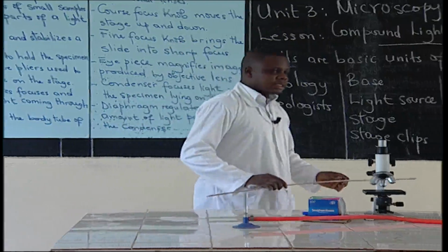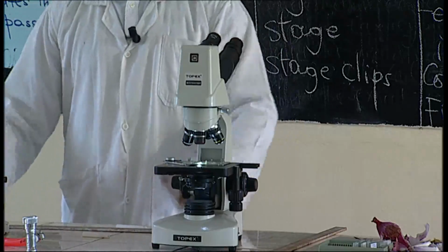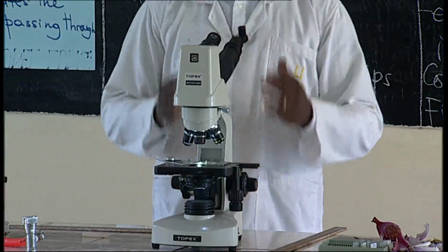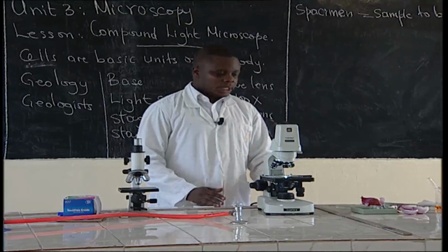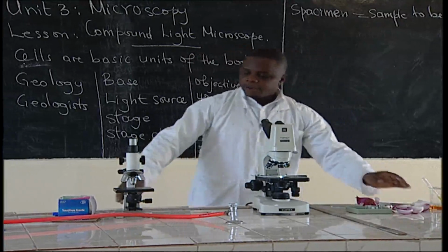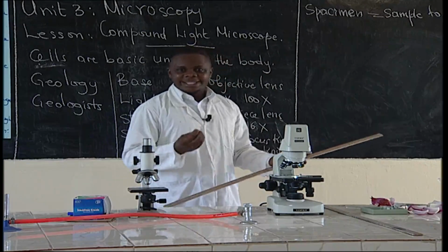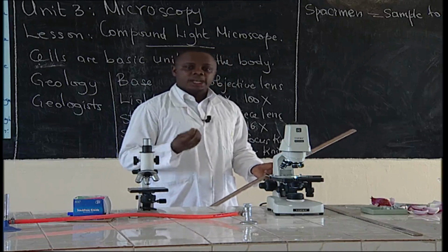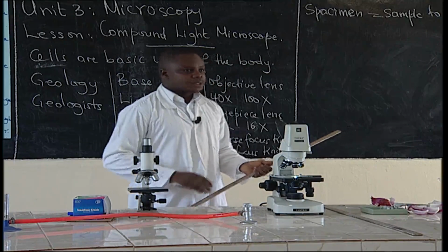We have seen that in our labs, we can have prepared slides, which were prepared by teachers or other scientists. We can also prepare our own cells. Like you have seen, we have prepared onion cell, getting it from the onion. Then from there, we have homework to test our level of understanding, because you have followed all the steps of the lesson, and then you should be able to answer these questions.